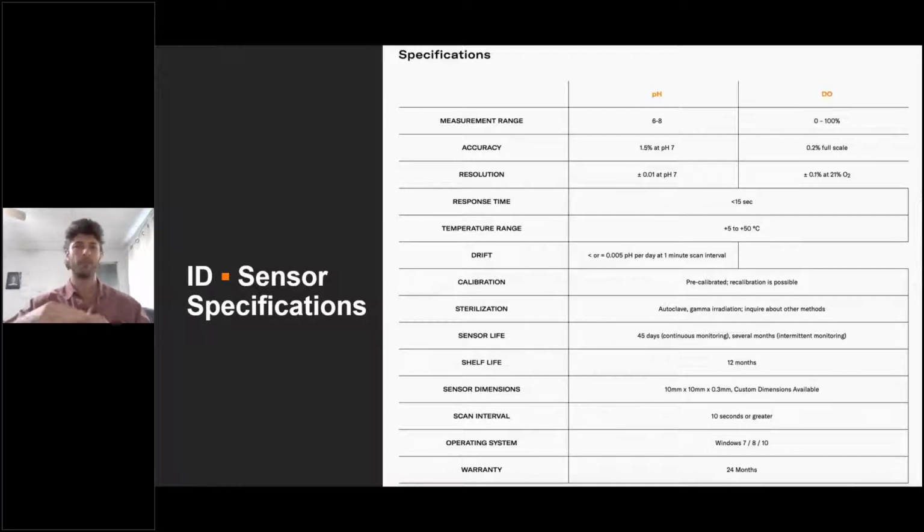So a few pieces of paper stacked on top of each other, about that height. And then imagine basically a sticker, and that's what the sensor looks like. But they can be as small as 3 millimeters in diameter, so you can put these sensors really anywhere you want to. And I'll show a little bit of that coming up.